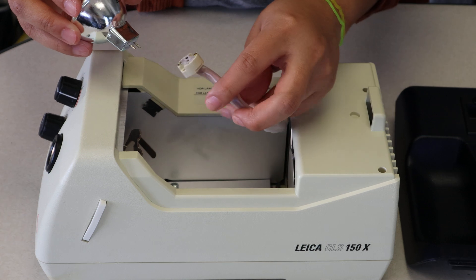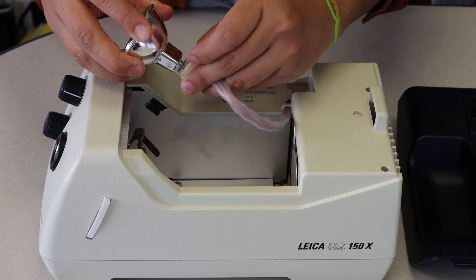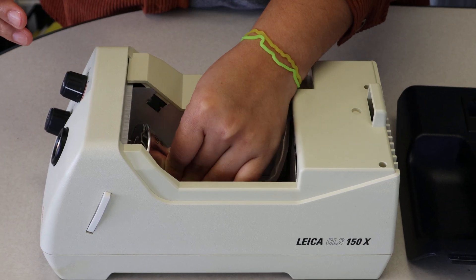Once you do that, you'll grab your new bulb, do the reverse — just plug it into the socket. Make sure you press it in firmly; it doesn't matter which way it goes. And then just slide the bulb back into the clip housing.